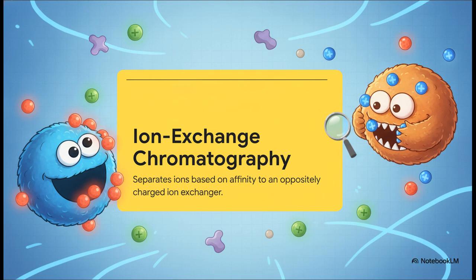Simply put, IEX separates ions and polar molecules based on their reversible Coulombic affinity to an oppositely charged ion exchanger. It sounds super technical, but think of it kind of like microscopic Velcro. Opposite charges attract and stick together. So if you have a positively charged target, you're going to use a negatively charged stationary phase and vice versa. It's a highly targeted, localized charge interaction.